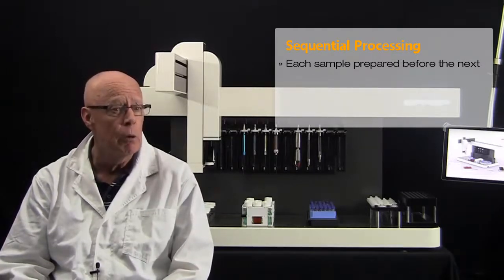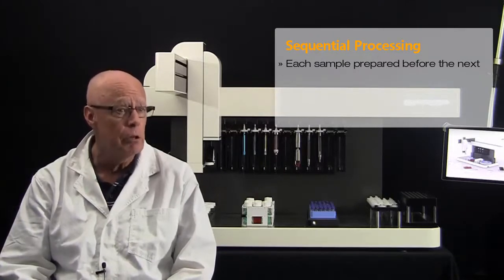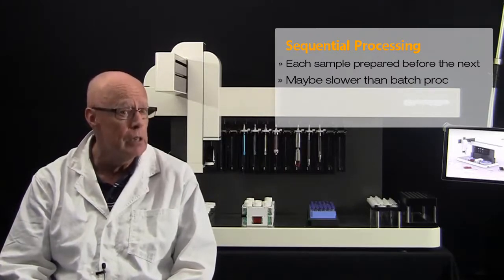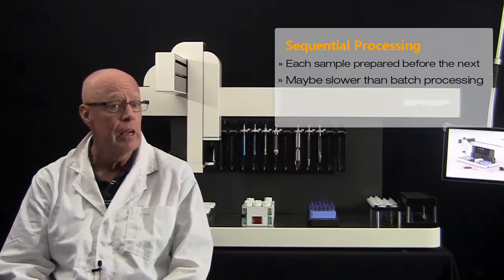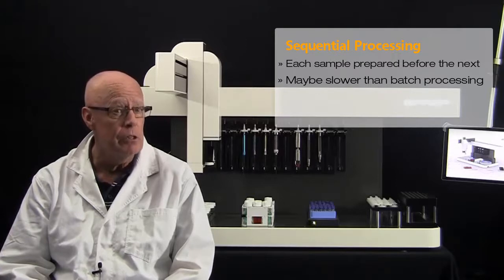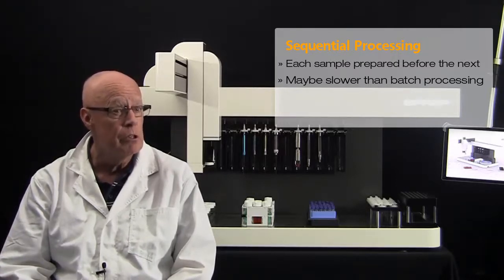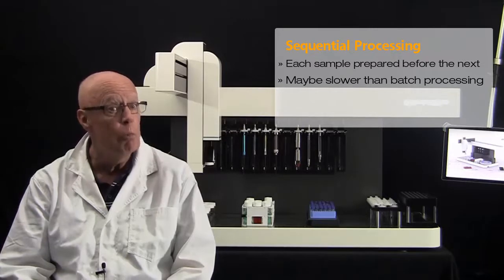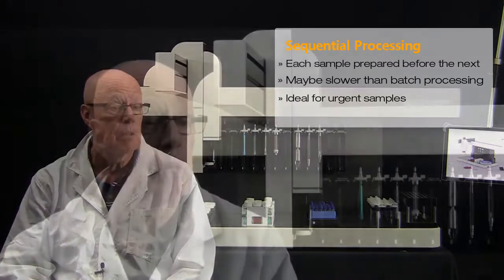It should be noted, however, that sequential processing is normally slower than batch processing in terms of the time taken to complete the whole sample set. This is because it typically requires tool changing and syringe washing between the tasks. But for some applications, sequential processing may be required for reasons of sample instability or post-sample processing, where a single sample needs to be completed before going on to a second sample.